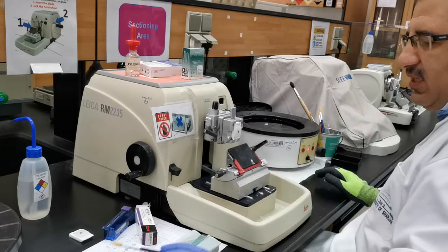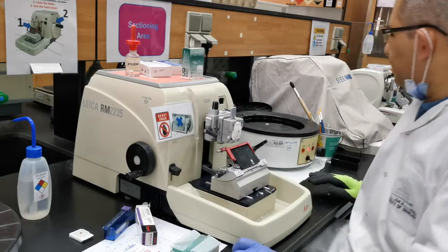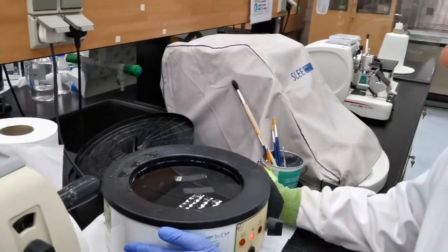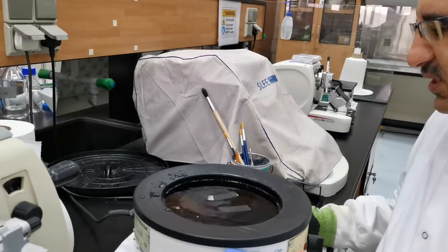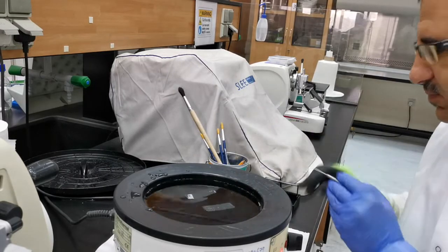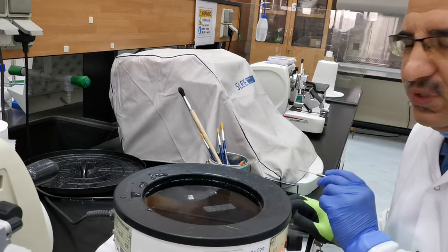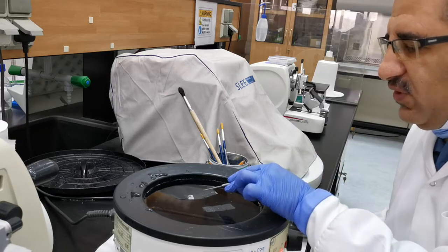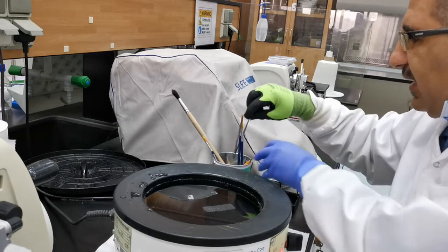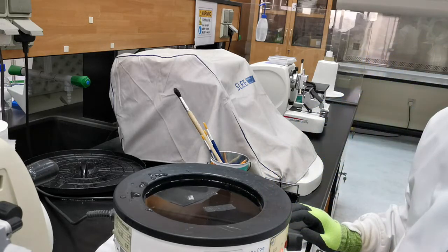These sections now need maybe one minute on the water bath. Let me cover this one — it's locked. After maybe just one minute, your sections will spread. Now let's say on this one I need only this section — I don't want the others. How can I separate them from each other? What you need to use is a tweezer, and make sure the edges of the tweezer are clean and don't contain any dirt or paraffin.